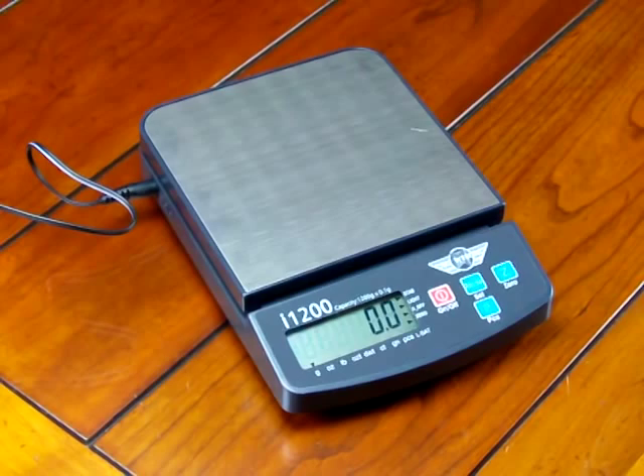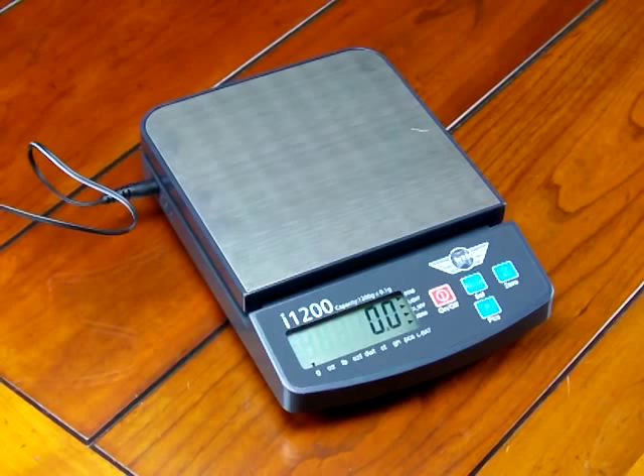In this demonstration we'd like to show you some of the features of the MyWay i1200 scale. This scale is 1200 grams by a tenth of a gram.